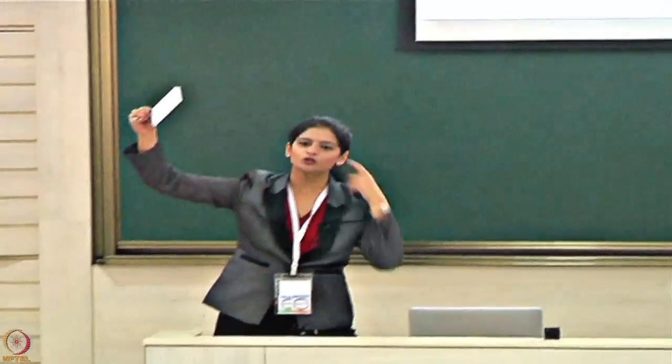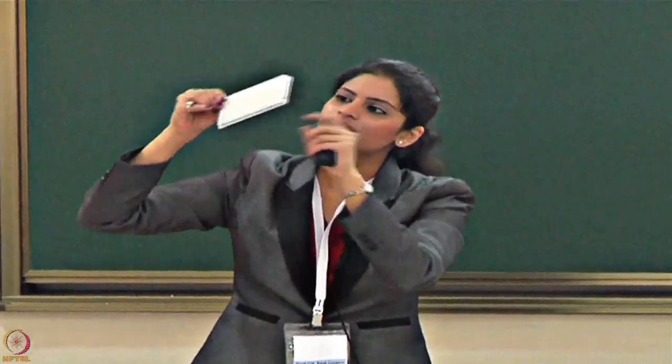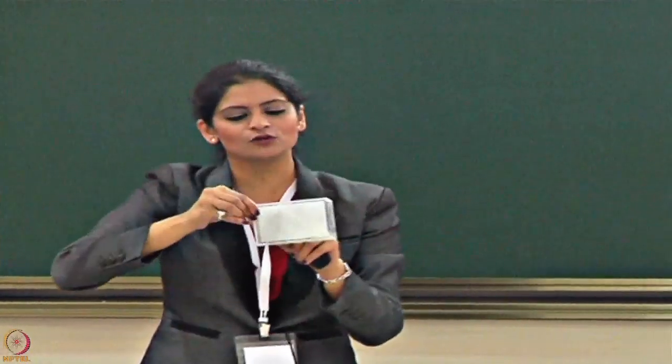If you fill all the wells, sometimes the human eye cannot really see if all the wells are full or not. I have had my own experience with pipetting so many different samples in the 384 style. If you miss one well and you put that plate in a reader, what's going to happen to that one antibody? It's not going to print. It's not going to get picked up. It's not going to get detected. So you've missed the whole set. You'll have to go back, fill it again and start.